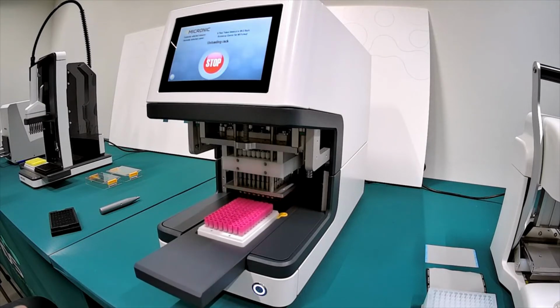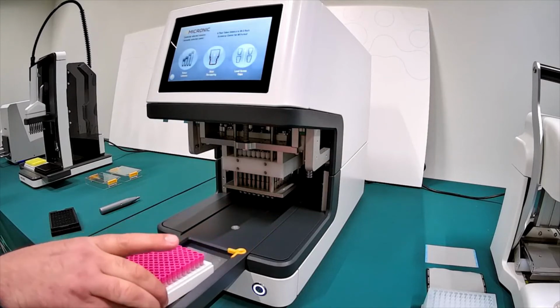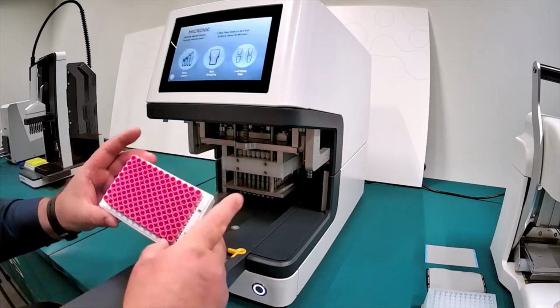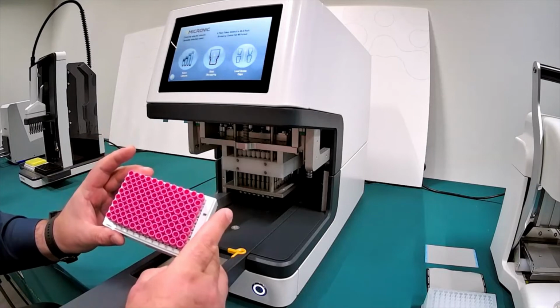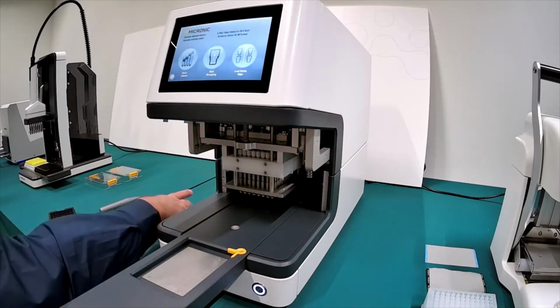And so simple it is. That's all. Thank you very much. So we have our rack capped again and ready to go for storage. Okay, Kevin, back to you.